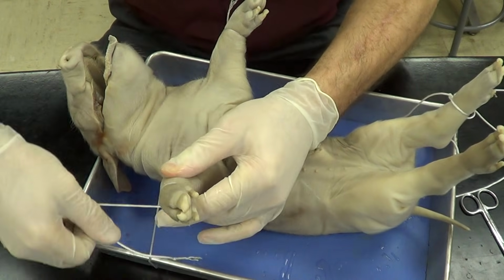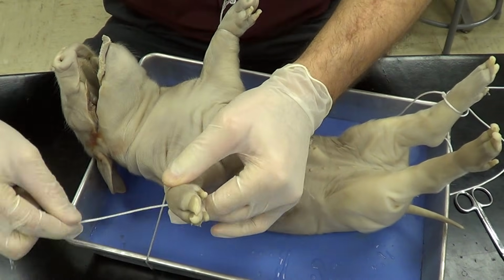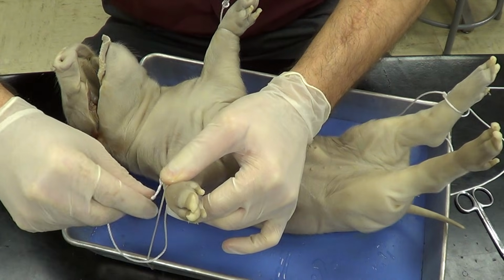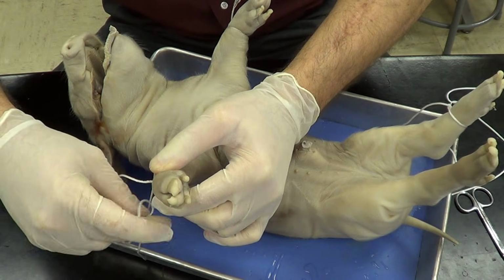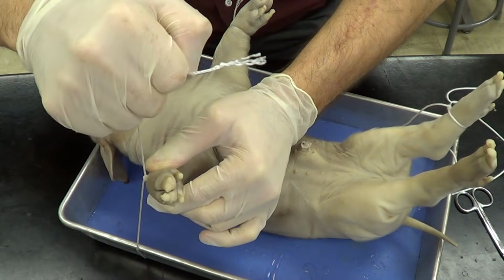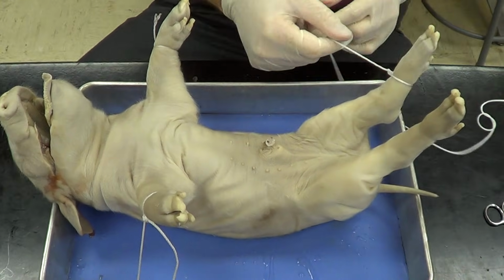Now this is a little bit easier if you're working in teams than working solo. But we'll do the best we can here. I'm going to go ahead and try to tie a knot here. And there we go. Now we're going to go ahead and do the hind legs.